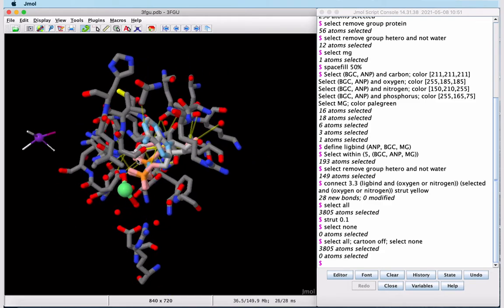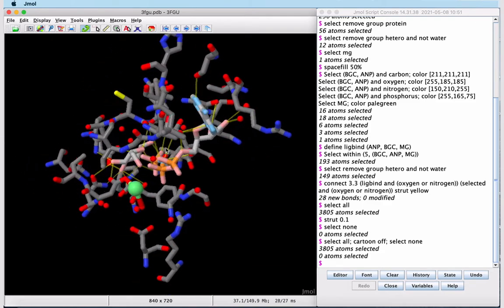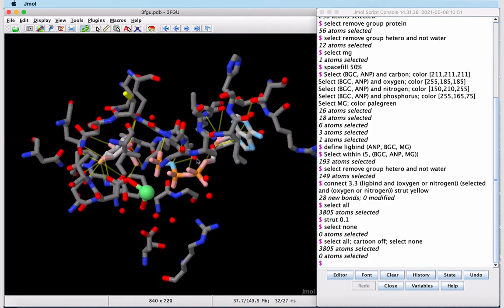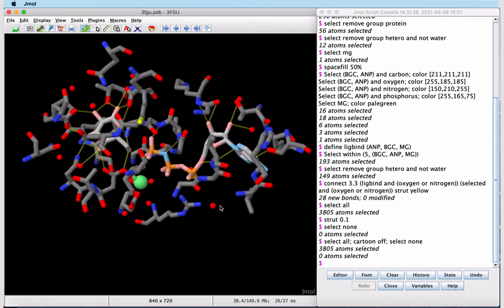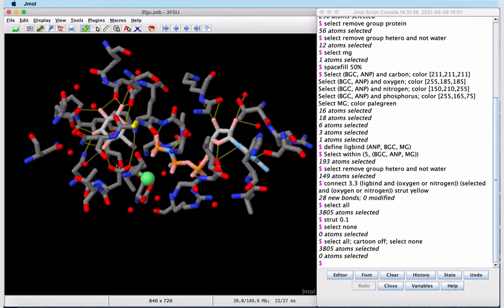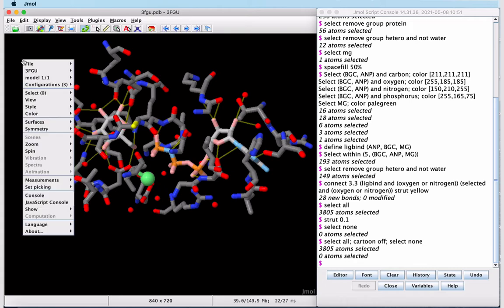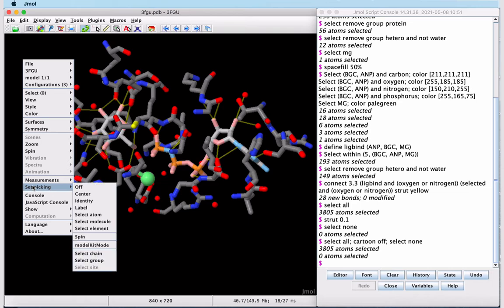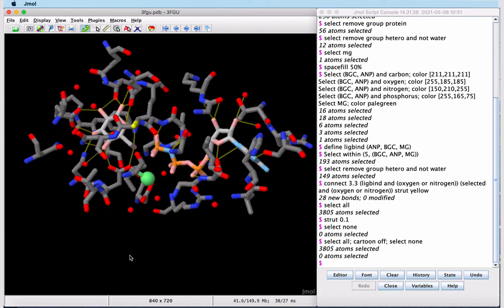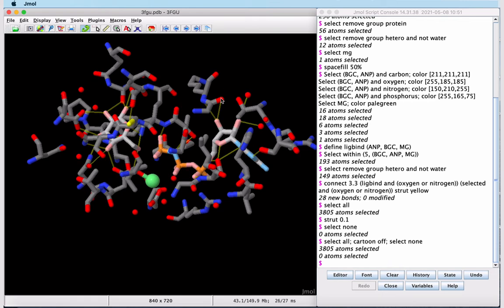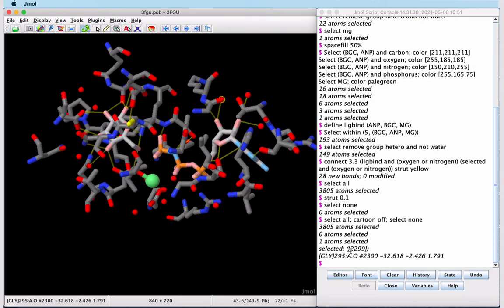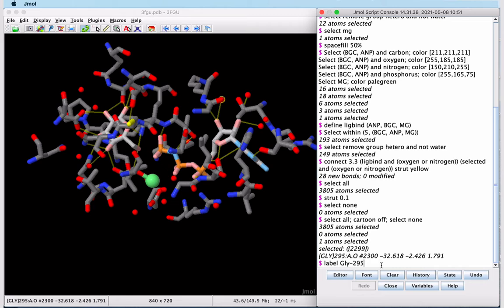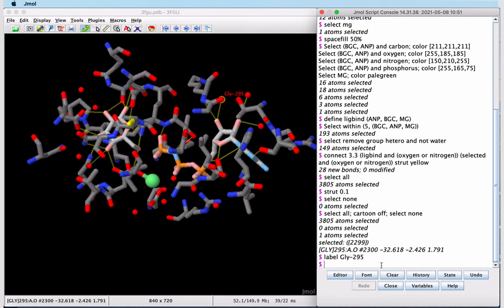Now we'd like to label some of the side chains that are hydrogen bonded directly to our ligand. To do this, we're going to set the picking so we can select atoms of these residues by clicking on them. So in the pop-up menu, by right-clicking, set picking, and we'll select atom. Now I can click on one atom, and we'll see this is glycine 295 that comes up in our console. We can type a command to label it, typing whatever we want here, and then pressing return will bring up our label. We can repeat this process for multiple residues in our structure. If you're deeply analyzing this, you'll probably want to find all of them and give them a label.